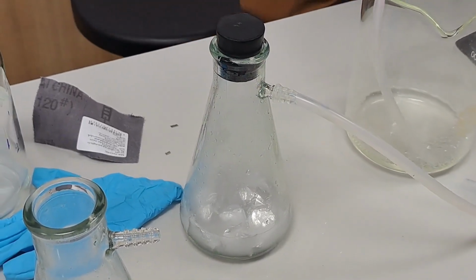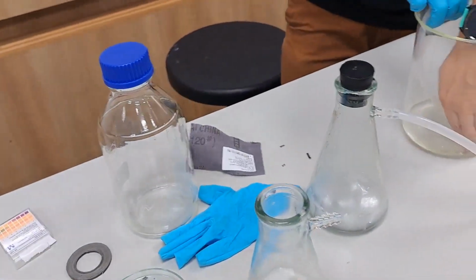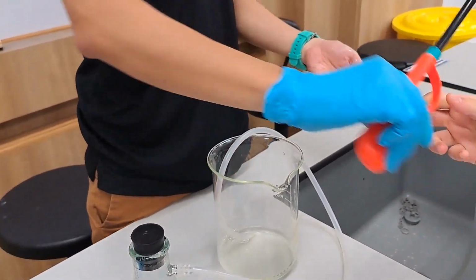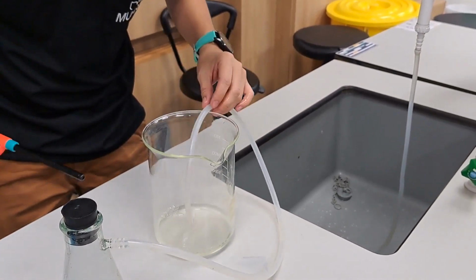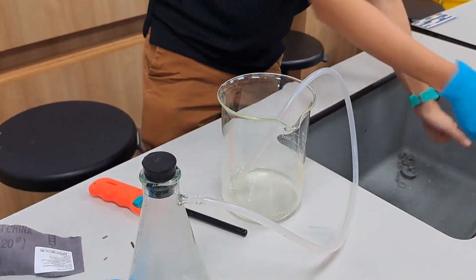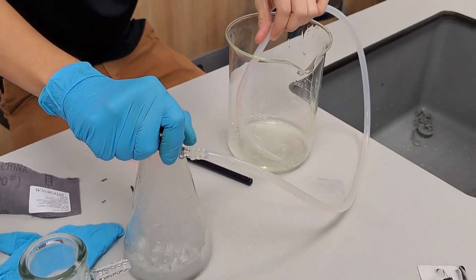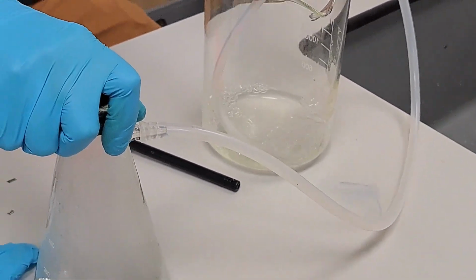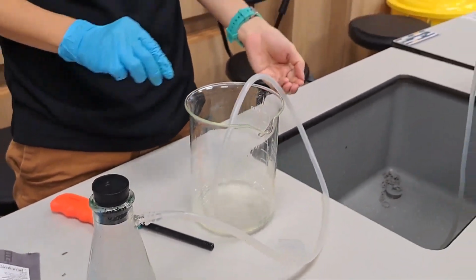Okay, let's see. Lighter, please. This is going to be a very brief moment. That thing from TikTok? Not happening. Not enough. Let's put more magnesium in. Like this. Hey, too much.